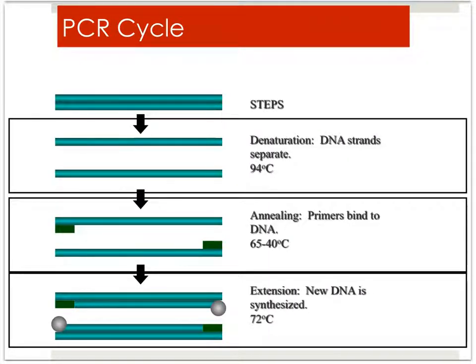What are the steps in PCR? I think most of you are familiar now. What are the steps? There are 3 essential steps. What is the first step? Denaturation, right? So I hope everybody is clear that DNA is double-stranded, right? Double-stranded DNA can be denatured, okay? So in PCR, it is a thermocycling method. So using 94, 95 degrees centigrade, you can denature DNA, right?